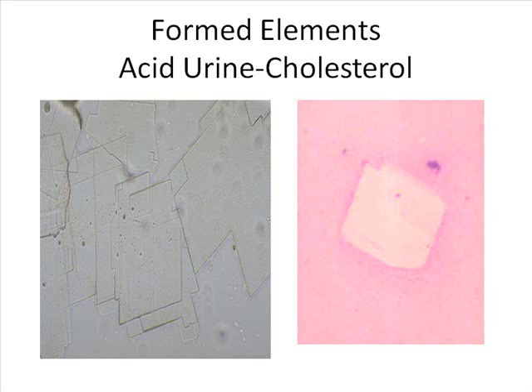And notice the notched edge, always in the corner, no matter what shape. See these notched edges? That is cholesterol. We found cholesterol once when we were doing urines in student lab, and the student called me over and says, I have cholesterol. And I'm like, get out. I've never even seen it. And sure enough, it was cholesterol because we had refrigerated it, and it had time to form. So it was really cool to be able to see that.